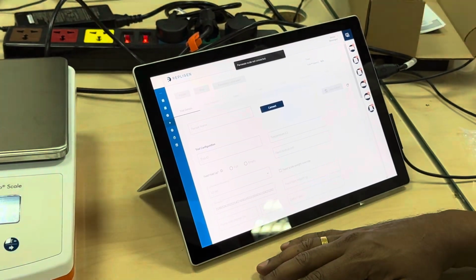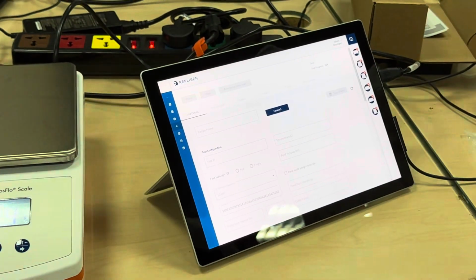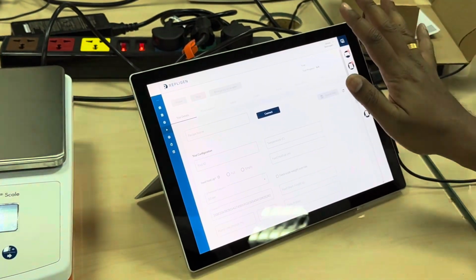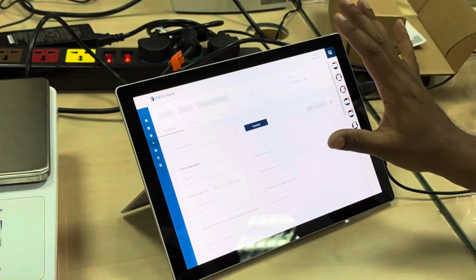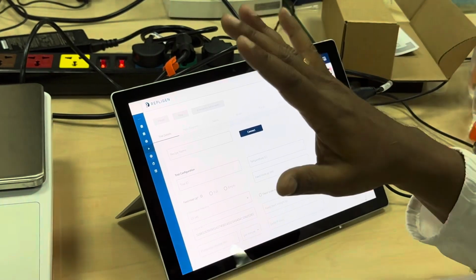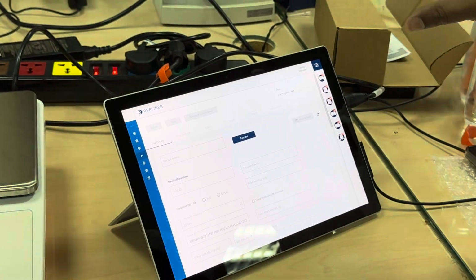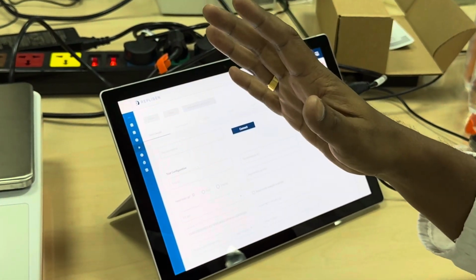Is it clear? Okay. A little complex, I can make out, because I'm just explaining and you're just listening. So there are many things you may still have doubts about. Once you start operating, then you'll come to know. It's so easy, so user friendly. You can create a nice recipe, and the good thing is once you create the recipe and start the process, you can take care of your other work. So once it reaches concentration, it automatically moves to diafiltration. Then once diafiltration is done, it stops. You don't need to be in front of the system all the time. So that's the beauty of this.